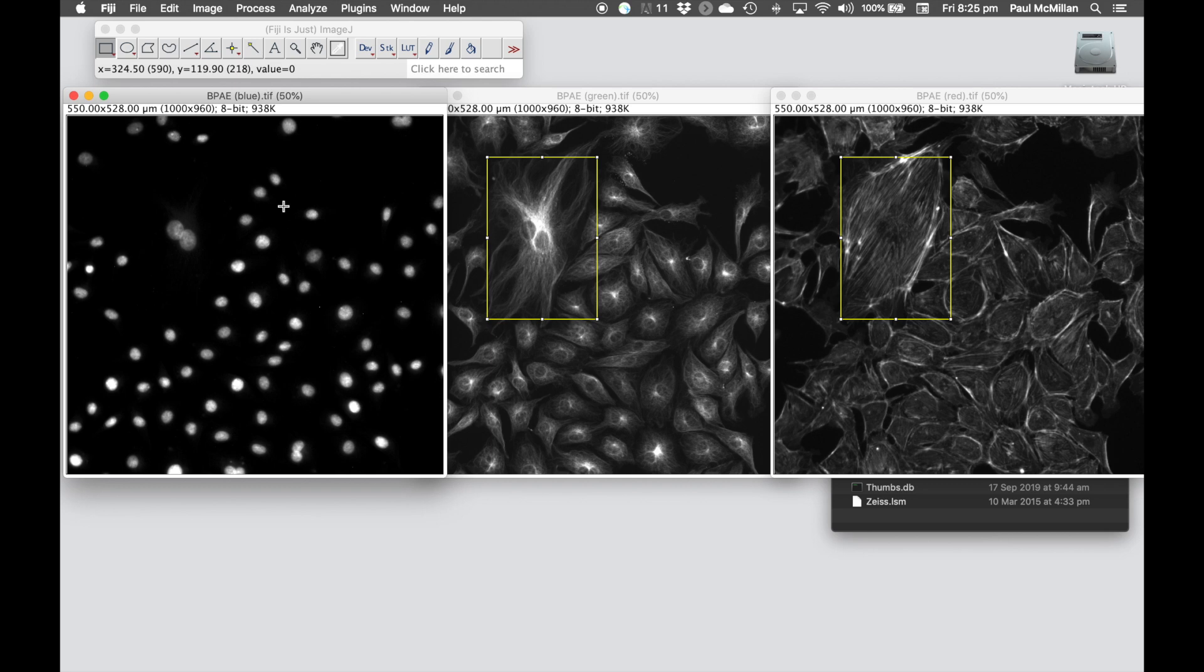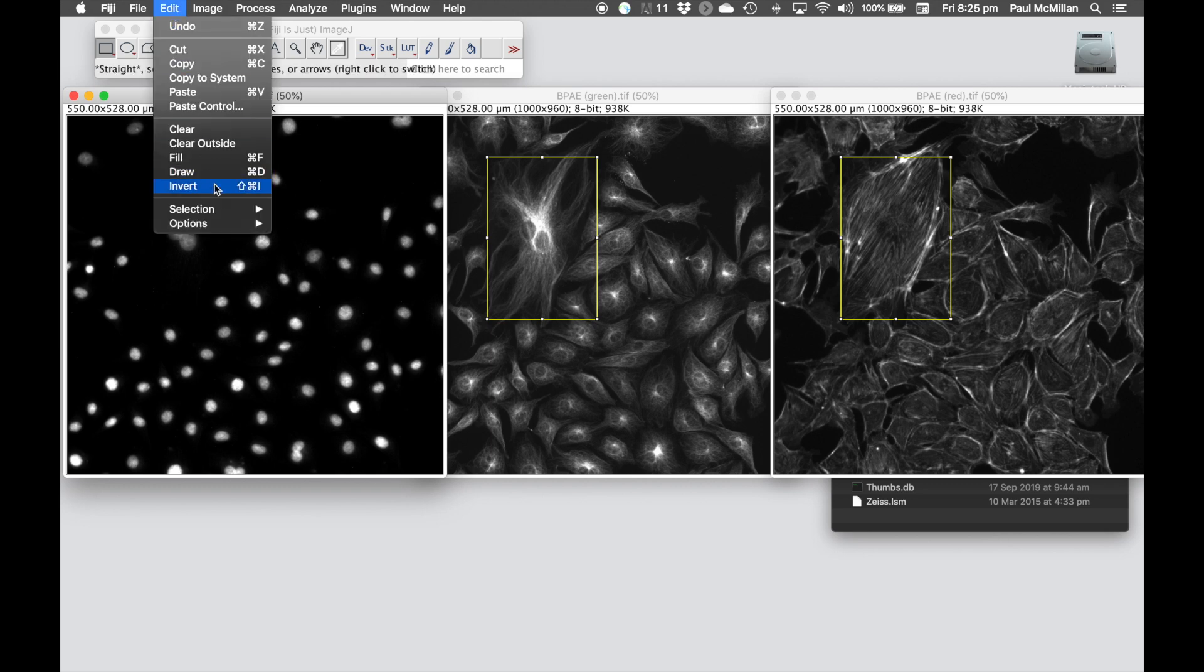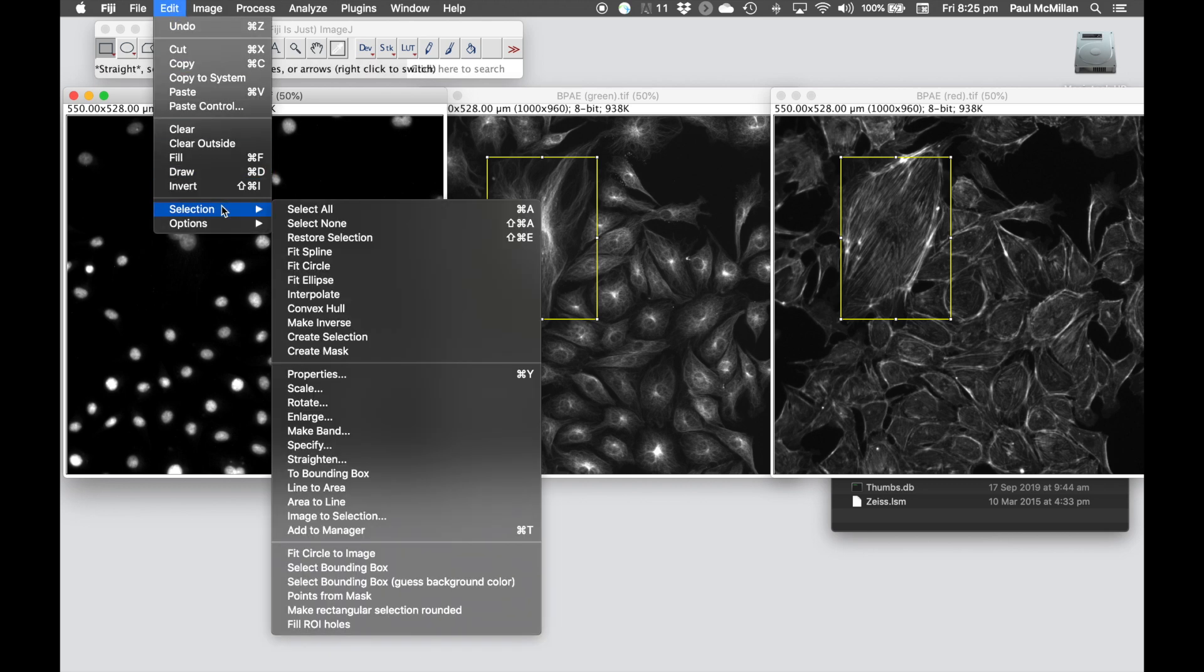We can do the same thing for the blue channel: Edit, Selection, Restore Selection.